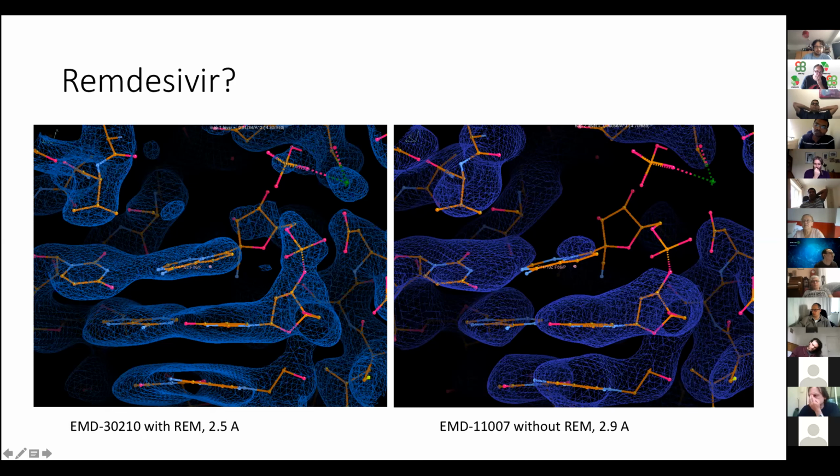We see some density in this ligand region here, but we don't see much of it in the unliganded one, where there shouldn't be ligand. Where your arrow was, just above the nucleotide, there's a piece of density. That's what Alan mentioned as well, right?